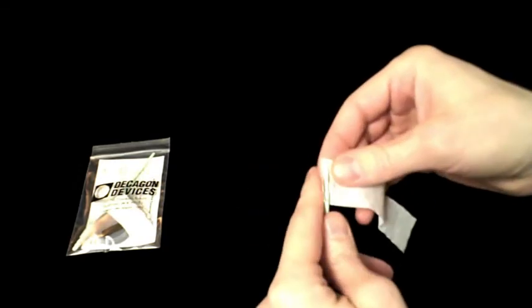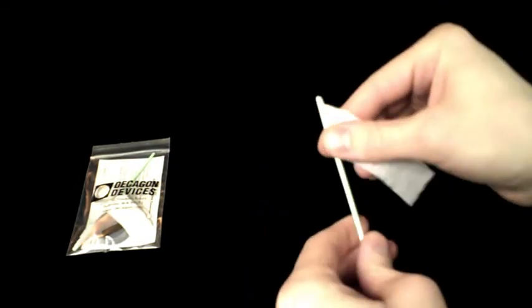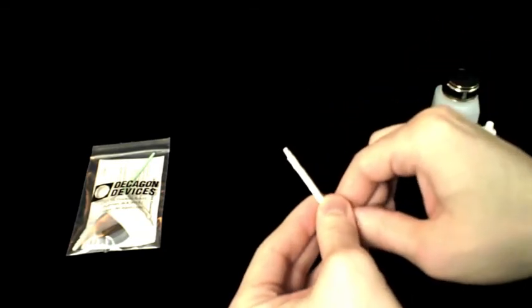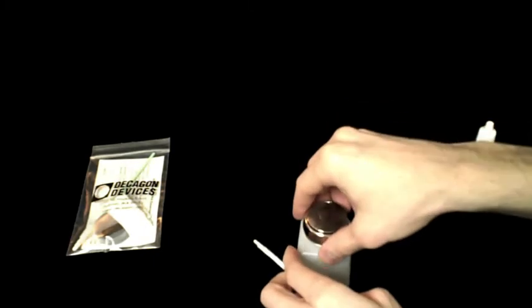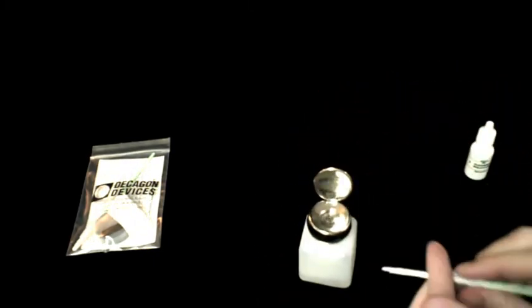Next, discard the old kimwipe strip and attach a new one to the plastic rod. This time, however, dampen the kimwipe using distilled water instead of the Decagon cleaning solution. Distilled water rinses away any residual contamination that may be left on the sensor block.